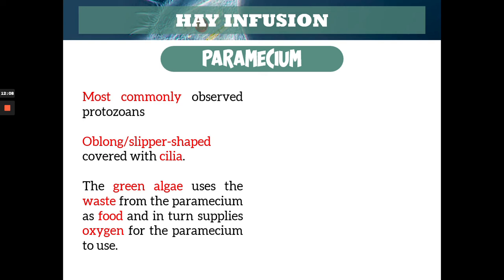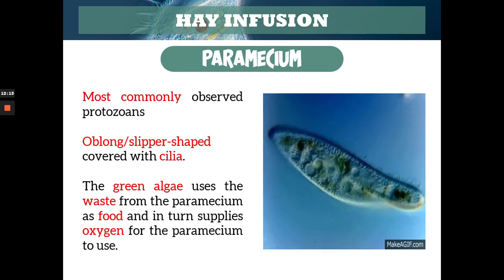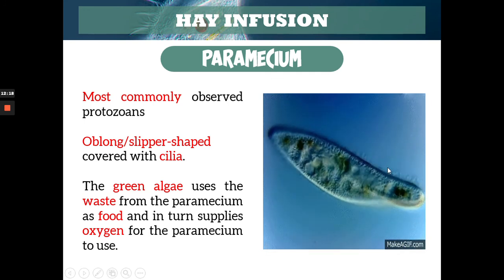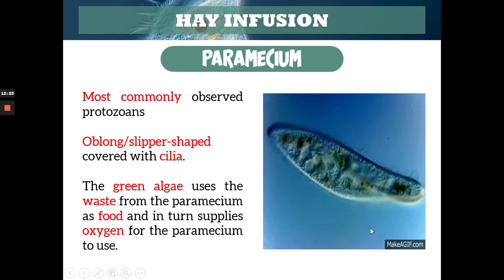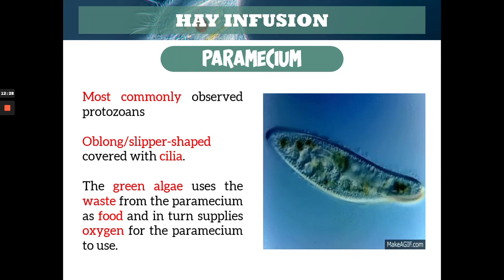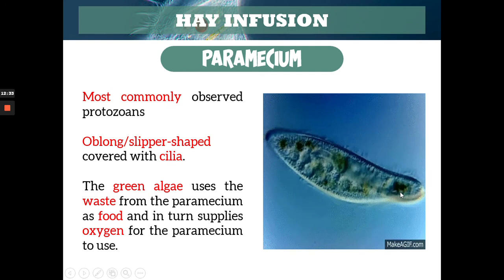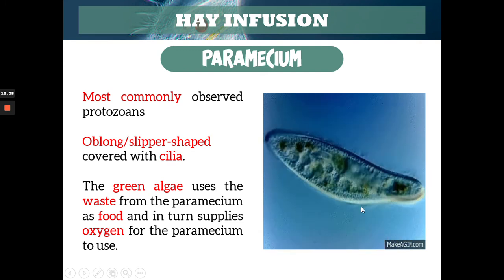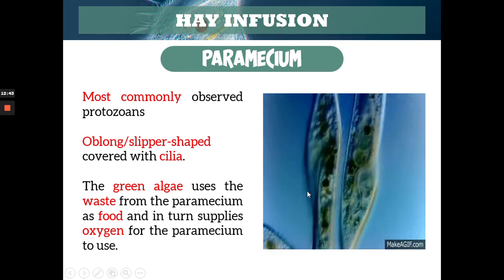This is an example of paramecium — that's why I recorded it this way so you can see the GIF. As you can see, the ones at the side that are moving — those are its cilia. The cilia are the organs of locomotion, used by paramecium for movement. As you can see, it looks like a slipper or oblong shape. That's paramecium, the most commonly observed protozoa.